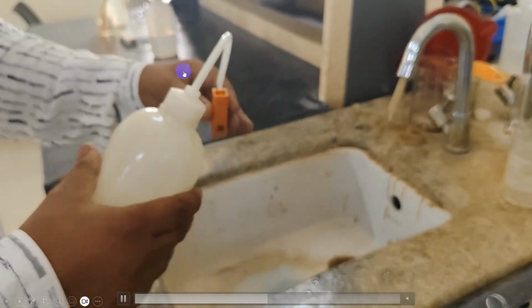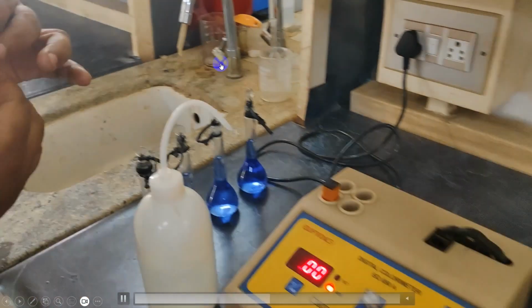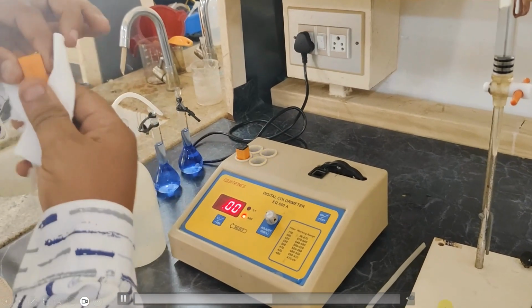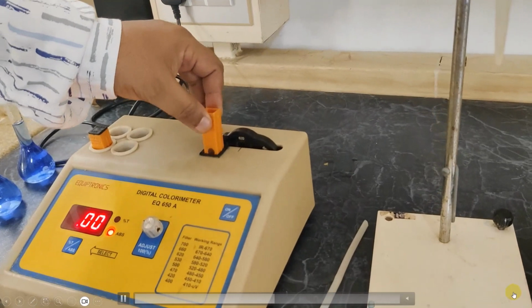And now fill the cuvette with distilled water, and set the instrument to 0 by placing it in the sample holder.